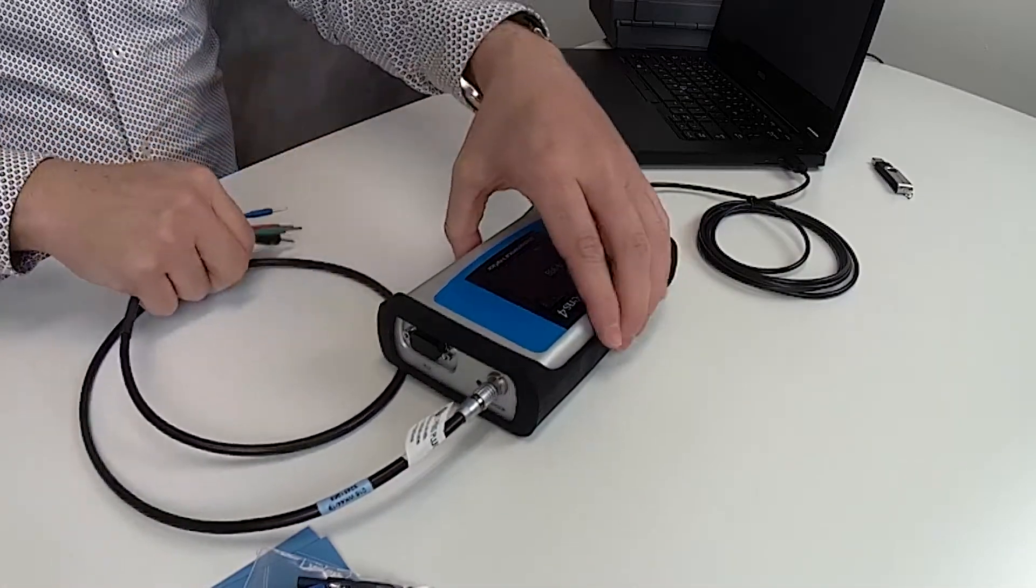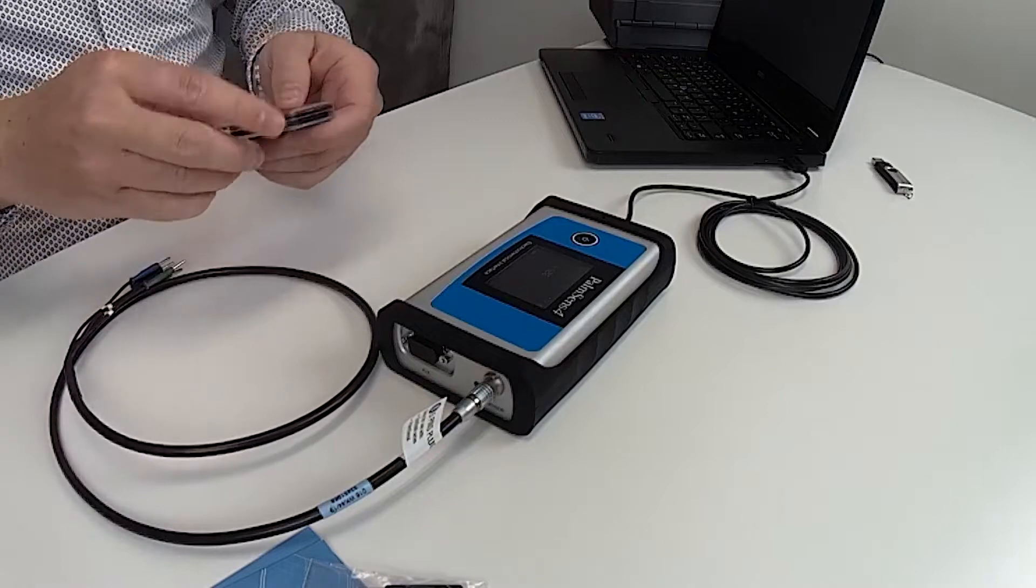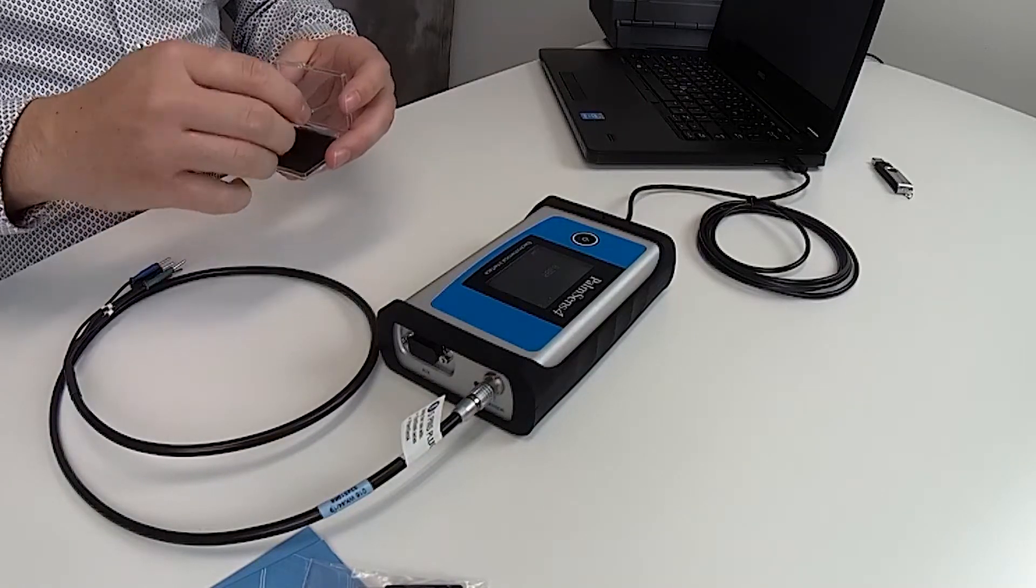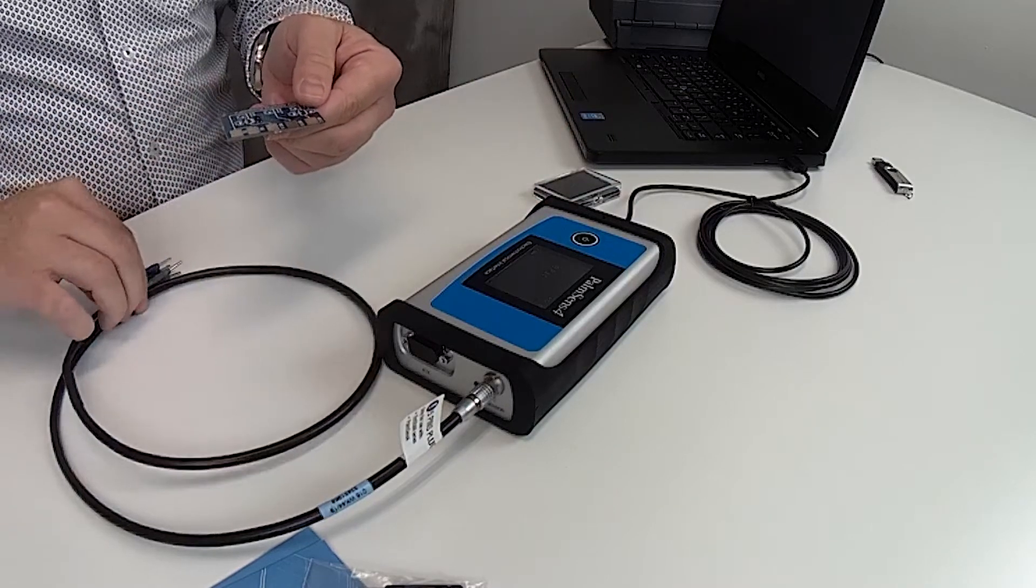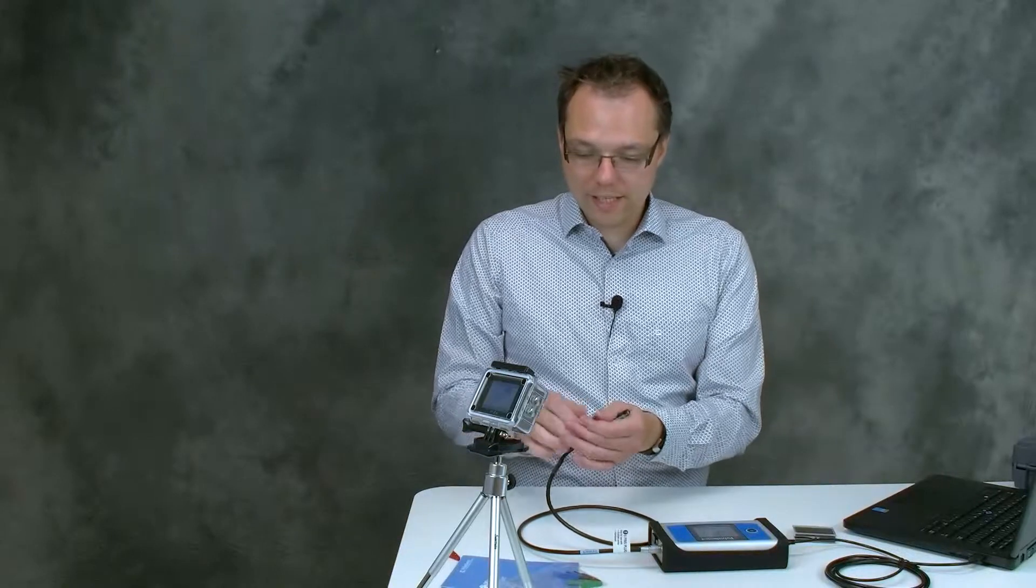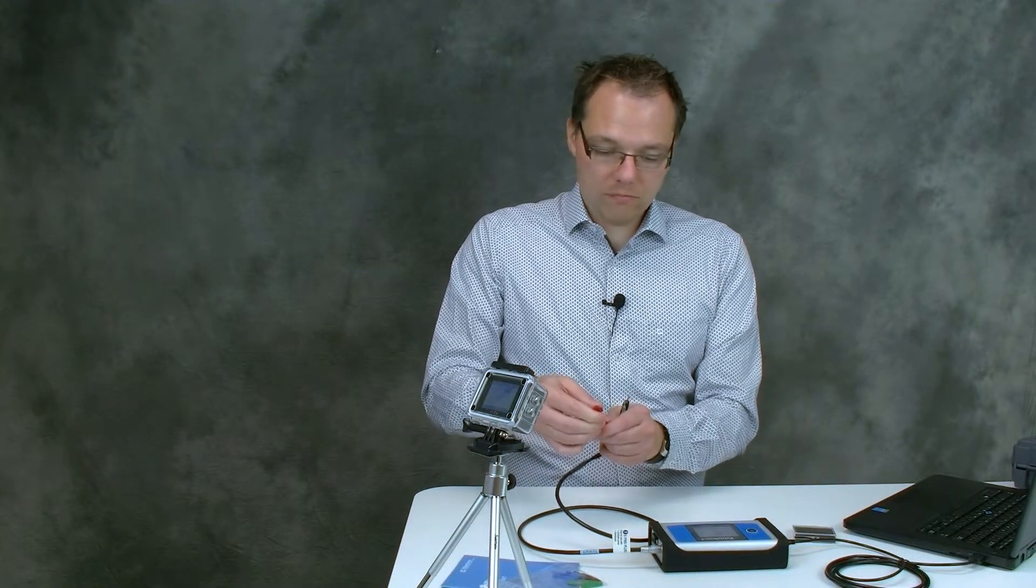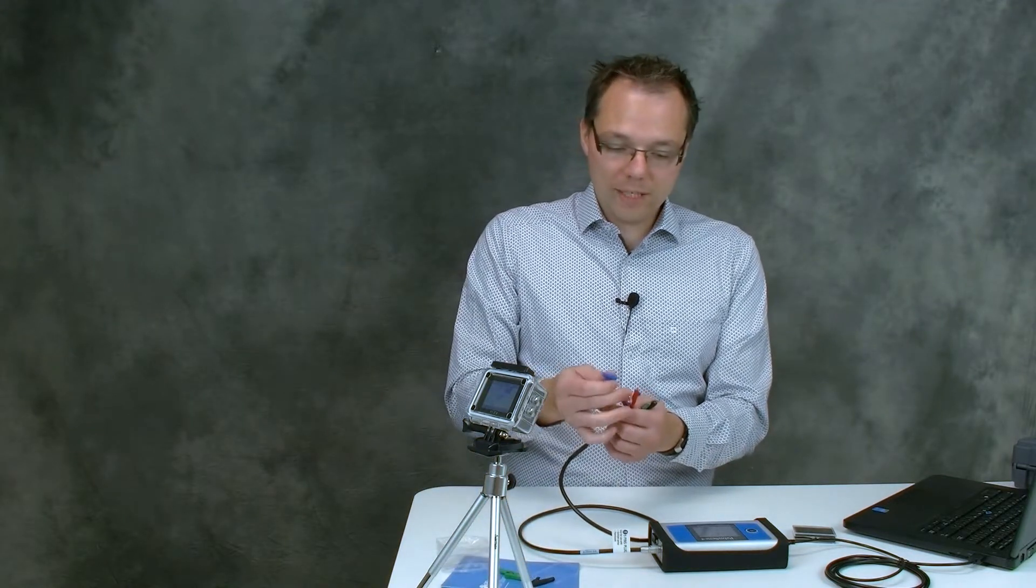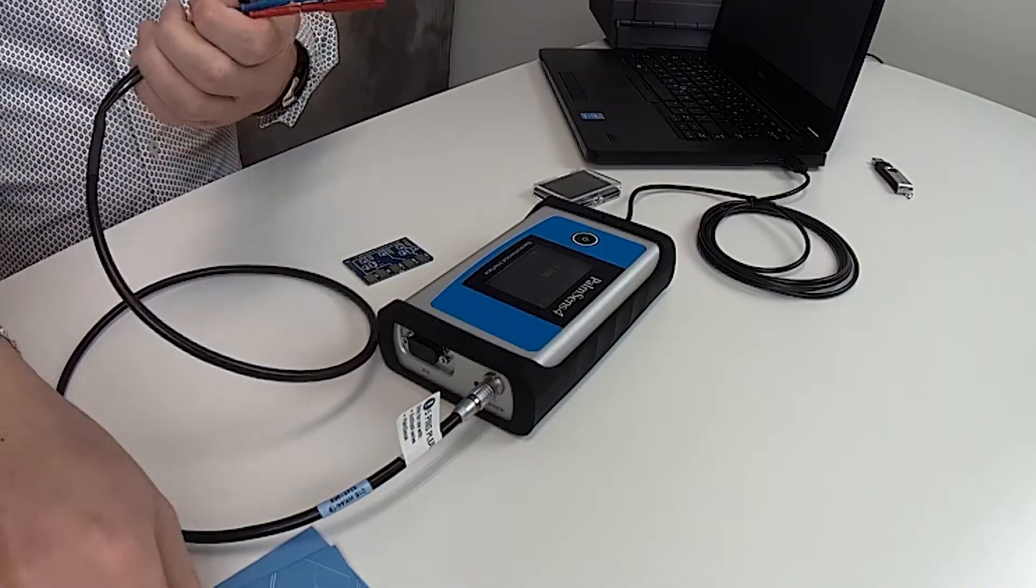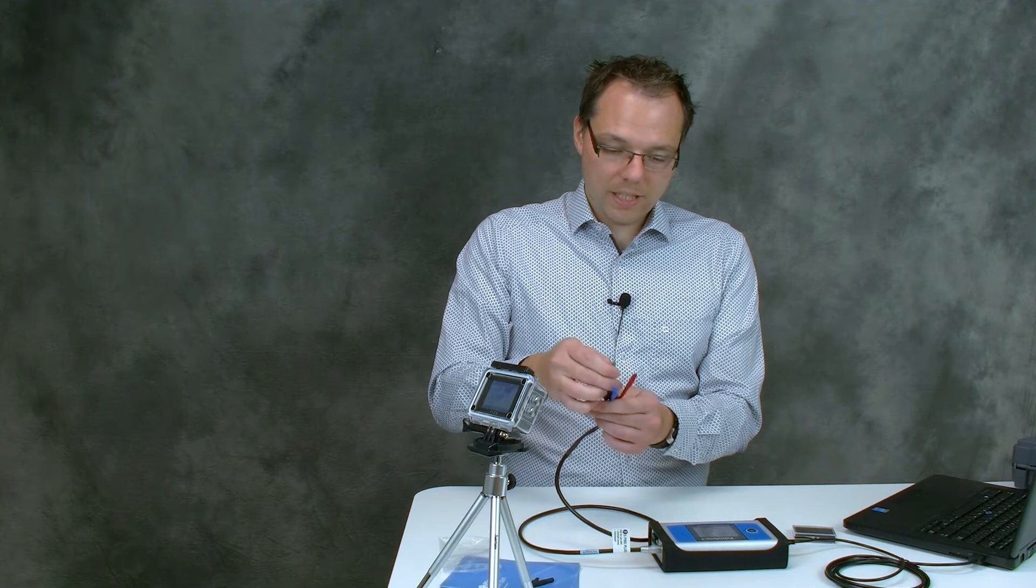We are going to use our dummy cell and as you can see the dummy cell has these contact pads and our cable ends in two millimeter banana plugs so we're going to use crocodile clips to connect to the dummy cell. With your instruments you get crocodile clips in the matching colors of the banana plug so we try to avoid as much confusion as we can.